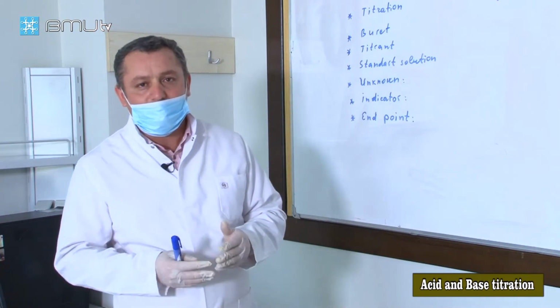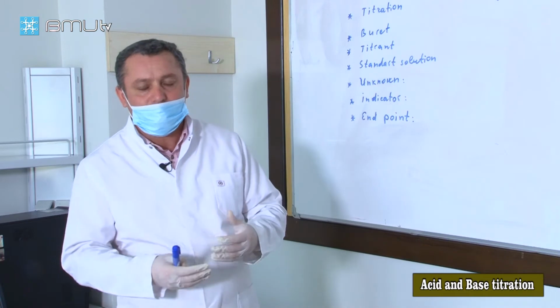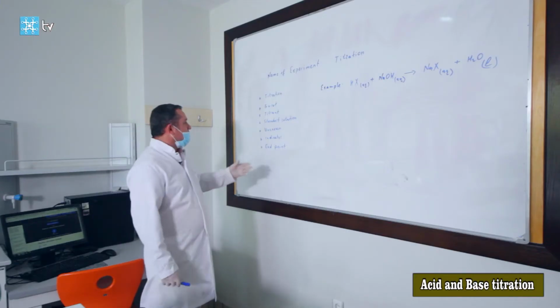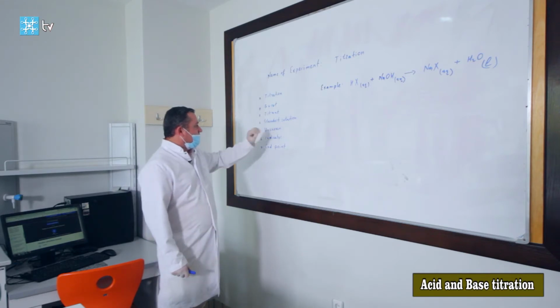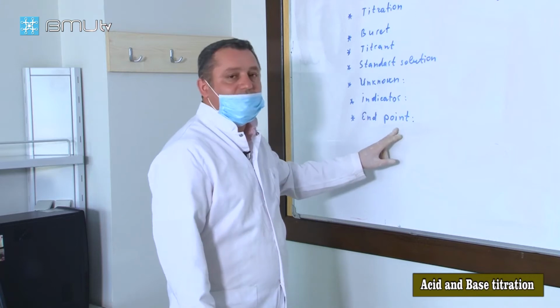During this experiment, we will encounter some terms. Let's pay attention to these terms: burette, titrant, standard solution, unknown, indicator, and end point.